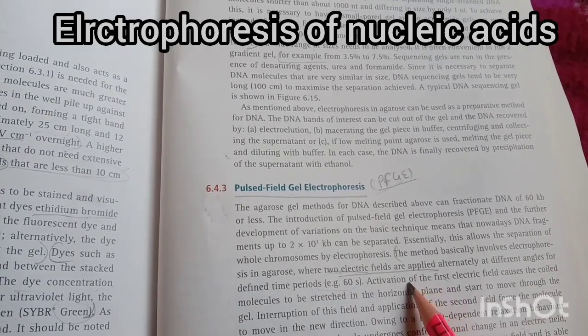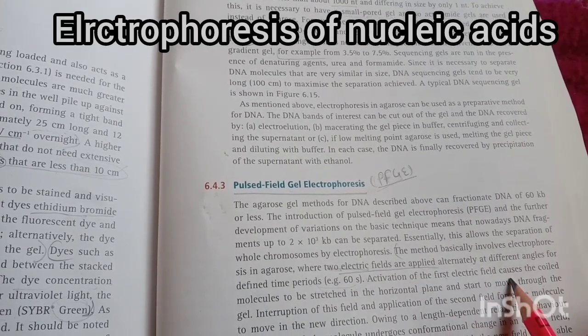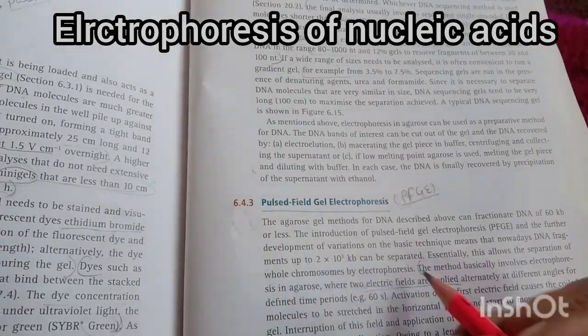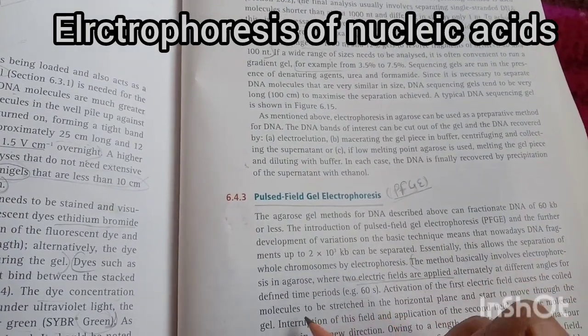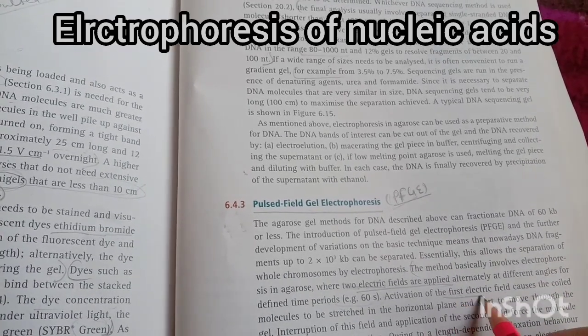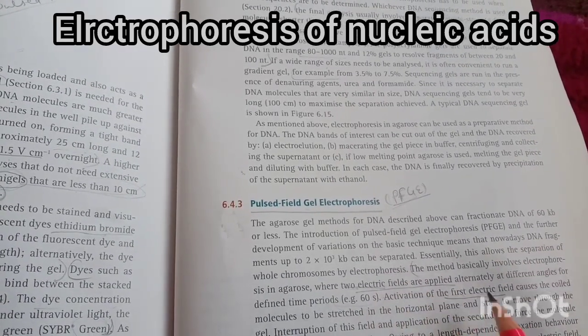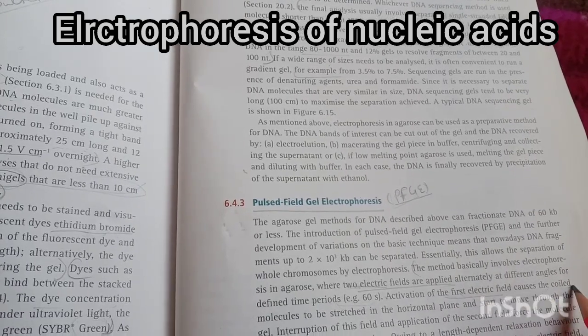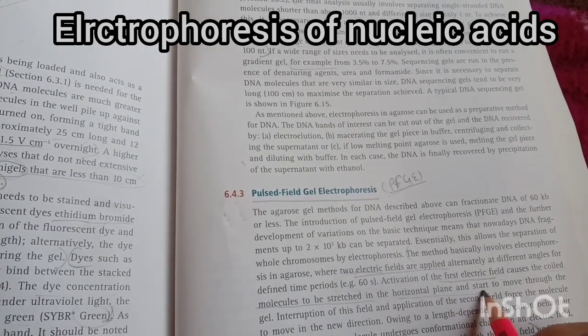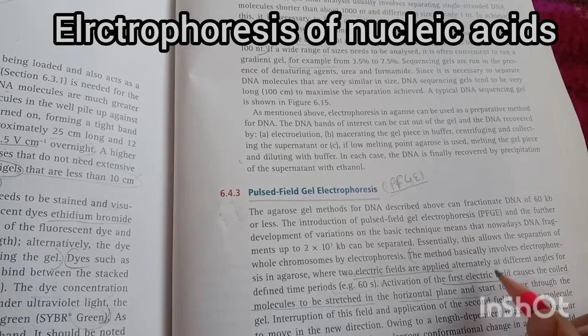Activation of the first electric field causes the coiled molecule to be stretched in the horizontal plane, and it starts to move through the gel.